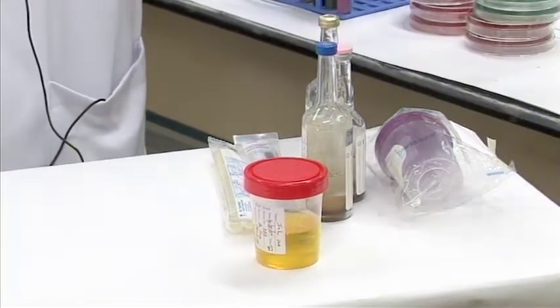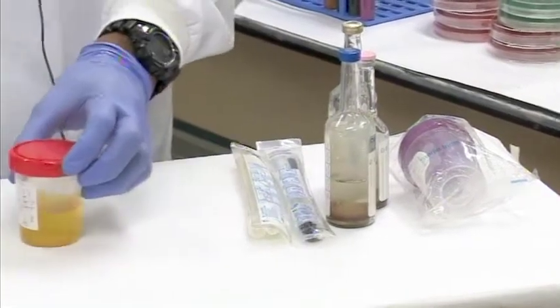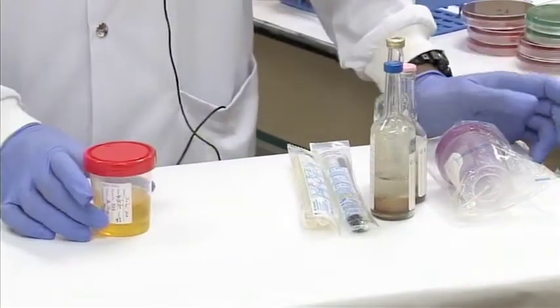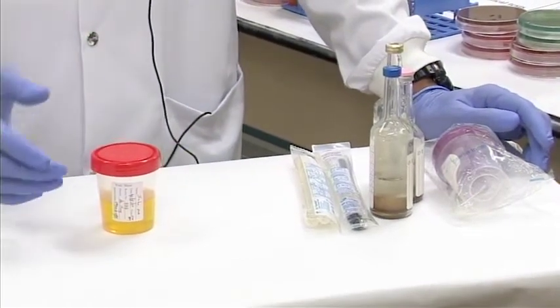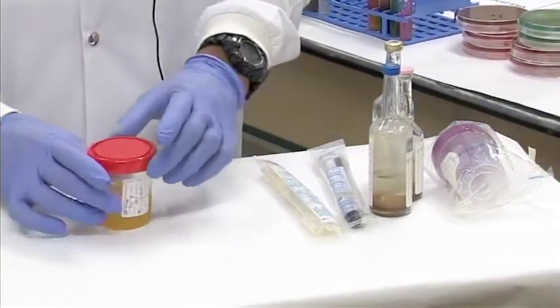Probably the most common sample you will encounter is a urine sample. In later videos, we will get into the actual processing of a urine sample. This is just an example to show you what a urine sample looks like.